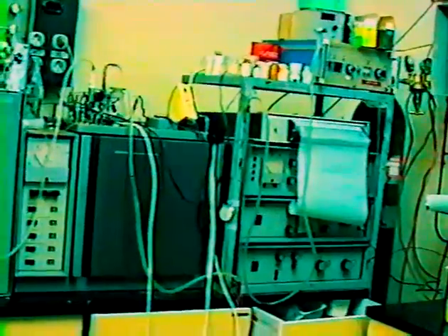Here, on this apparatus, we are studying the catalytic decomposition of methyl chloride on silica-supported palladium, and we have just turned to using another type of catalyst to get information on which kind of catalyst would be the most effective in this reaction.